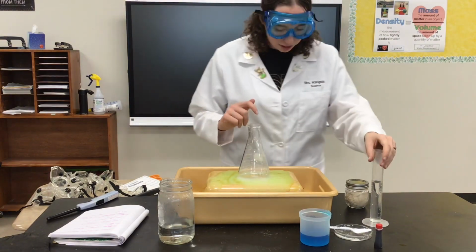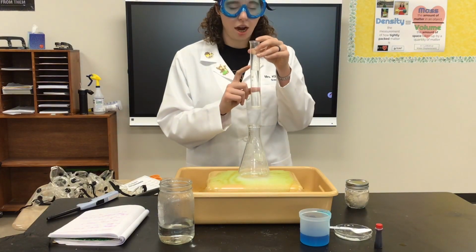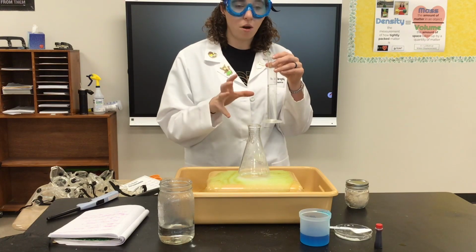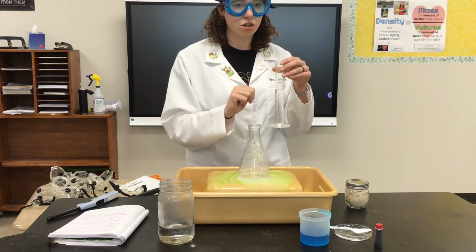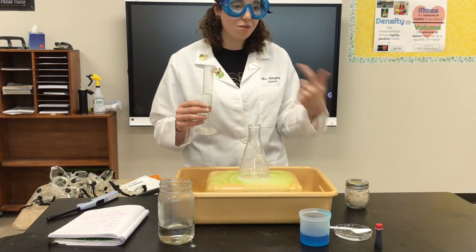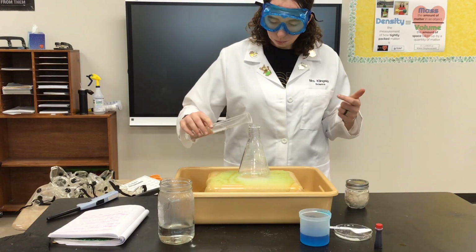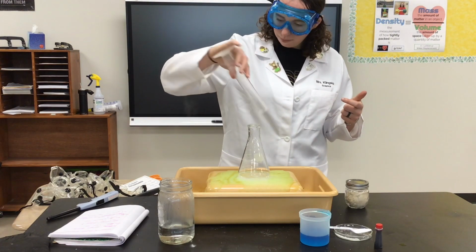So what I'm gonna start with is 70 milliliters of hydrogen peroxide. Now, hydrogen peroxide is H2O2. So it's like water, except that instead of just one oxygen, there's two. So 2 hydrogen and 2 oxygen atoms. You cannot drink H2O2, it is not the same as water, but it is something that you can buy at the grocery store. So I'm gonna add my hydrogen peroxide in here, okay?